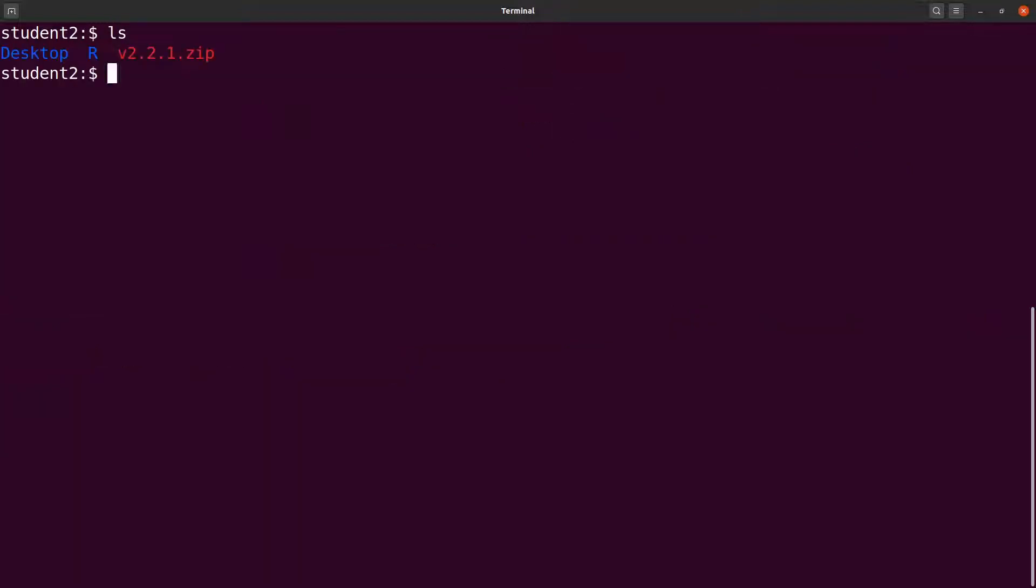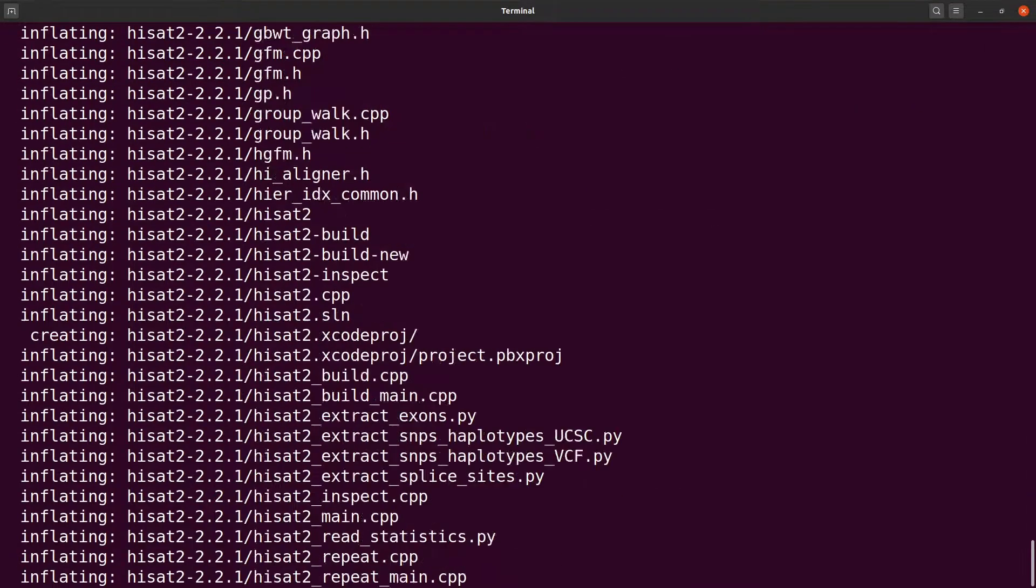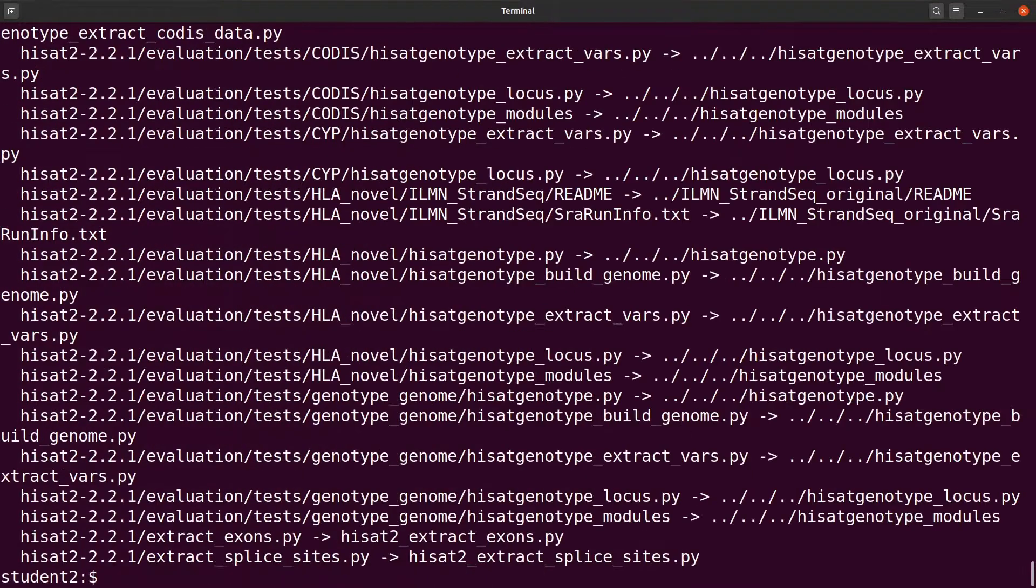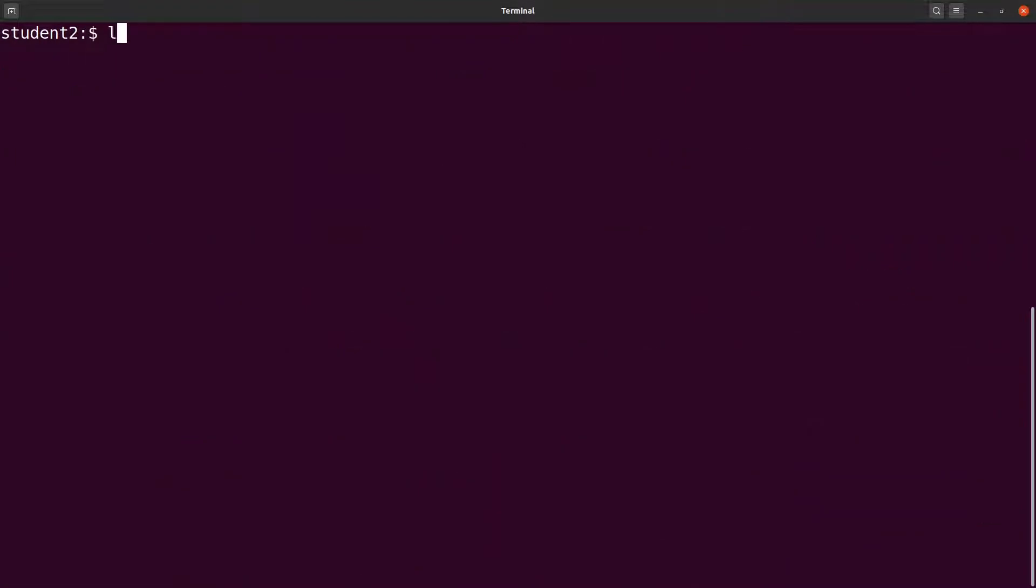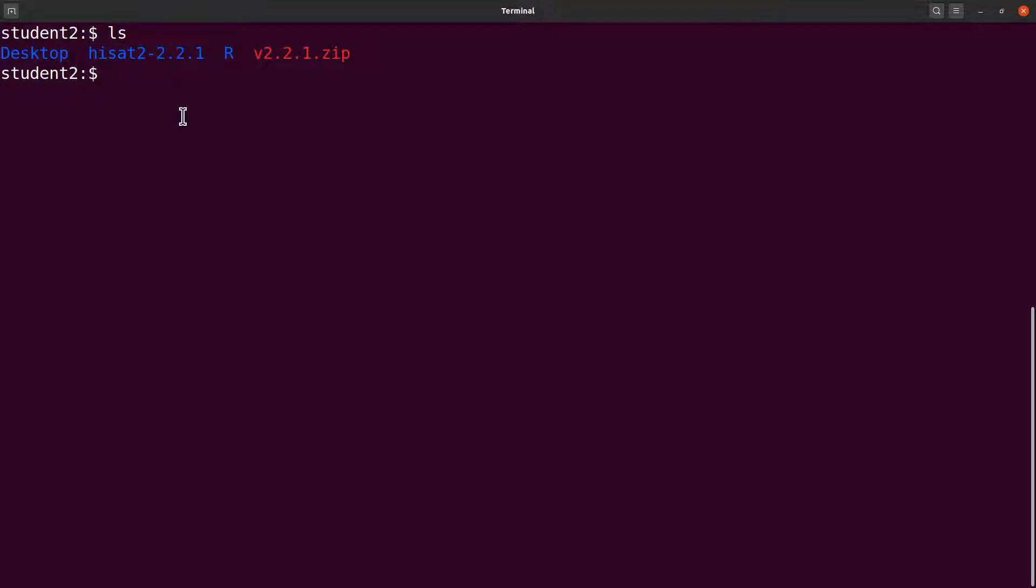The next thing I will do is to extract the content of this file. I will say unzip and then I will extract it. I will specify the name like this and run. It has been extracted. Let's clear the screen and continue. Let's do an ls and you will see a directory here.